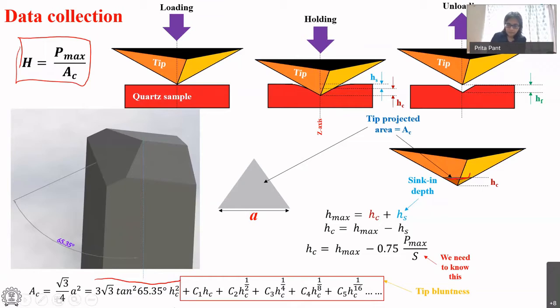Again, for our purposes today, this calculation has already been done. And I think you would have been given these constants, or you will be given constants today. You've already corrected your data for drift. Now, the only thing that is left for us to calculate is the slope of the unloading curve. And then we are set. We can move on with our hardness calculation.